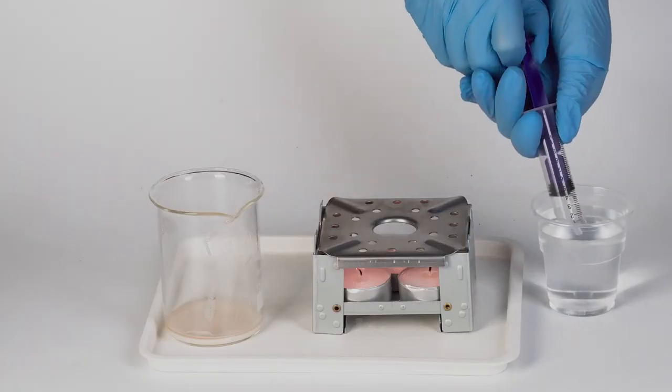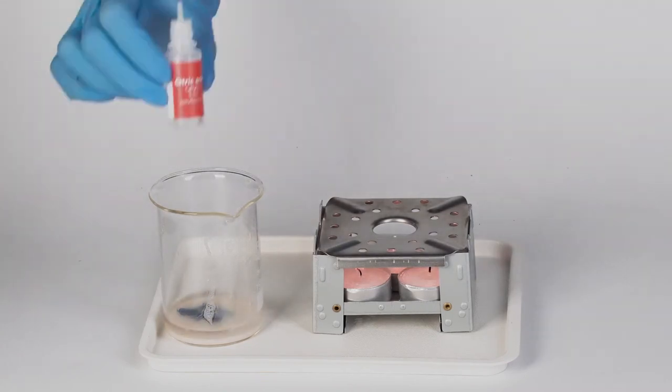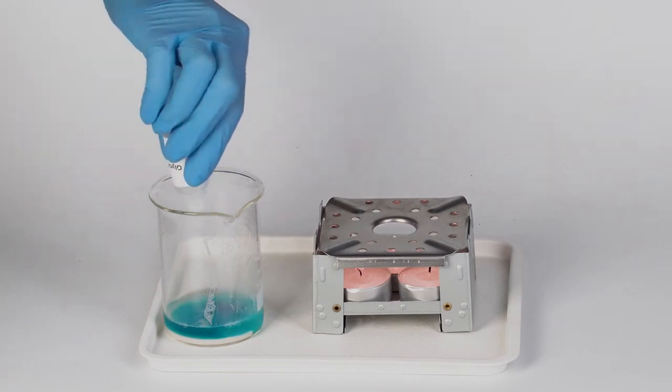Add 10 milliliters of water and two to three drops of methylene blue into the beaker. Then pour in all of the contents of the bottles with glycerol and citric acid.